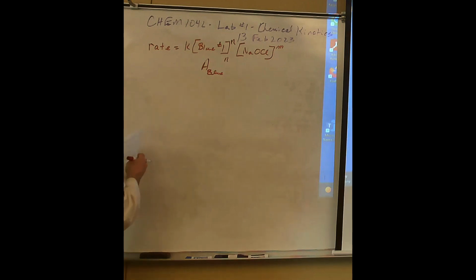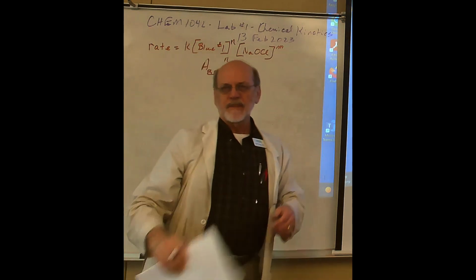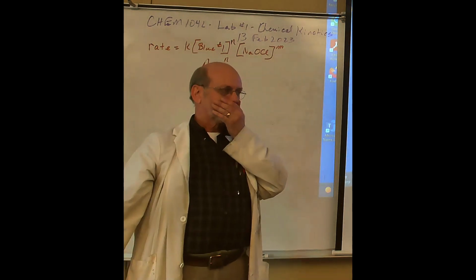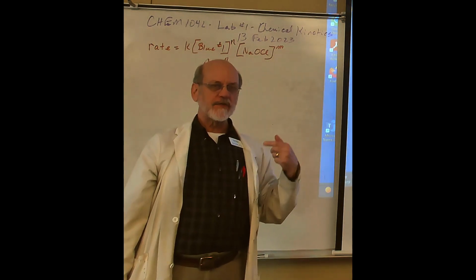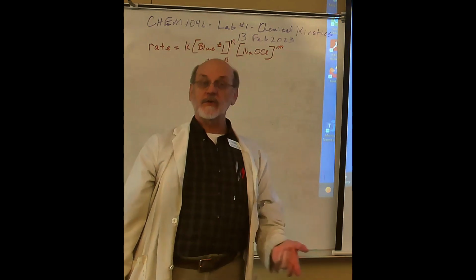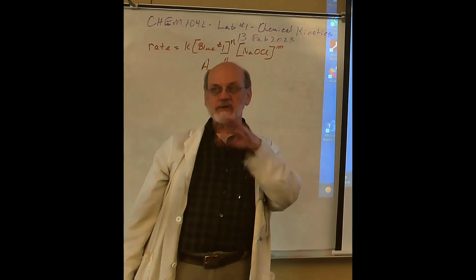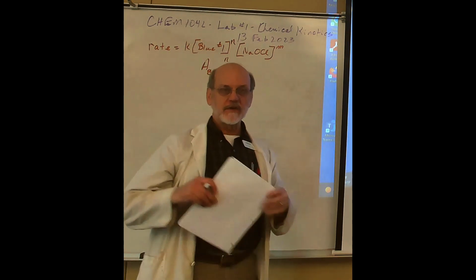Yeah, the Beer-Lambert law, sometimes it's written like this. When you first walk up to a spectrophotometer, depending on which one you're using, you need to be sure that the units you're measuring in are absorbance units, because they'll also have transmittance units, percent transmittance. Those are two different scales, so be sure you have the absorbance unit.